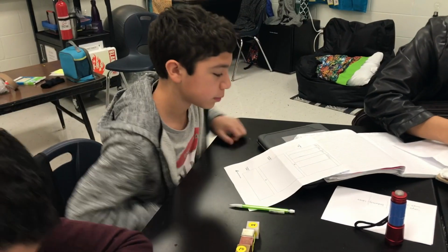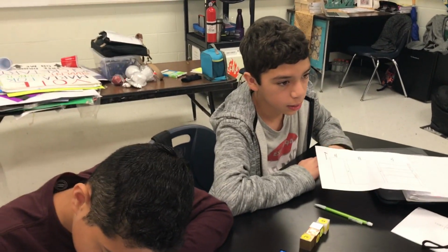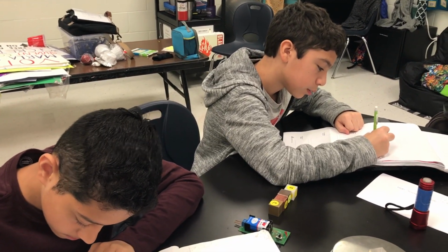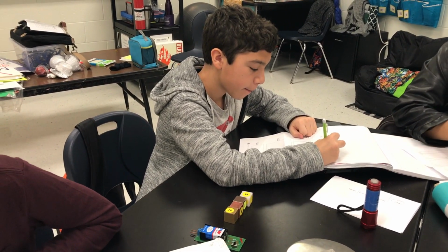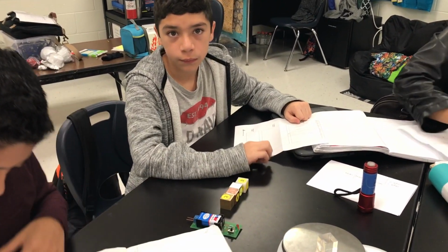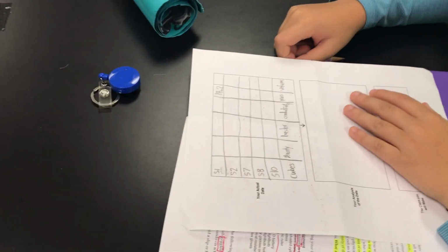So. Mass, volume, density. What else are you guys testing? So that would be the mass, right? Yes, that would be the mass. We're testing the conductivity, right? You're testing conductivity. Okay, so do you need to add that to your table? Yes. What else are you testing? And then either your luster or your magnetism. Okay. So which one are you guys going to test? We're doing the luster and the conductivity. Okay, so make sure those are on your table.